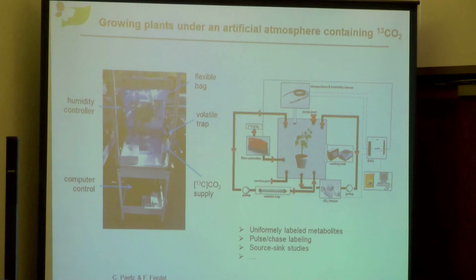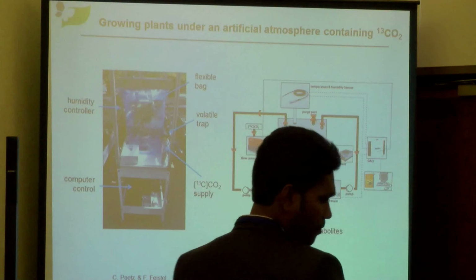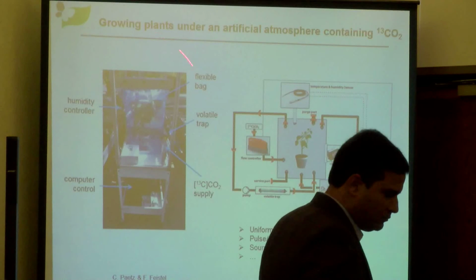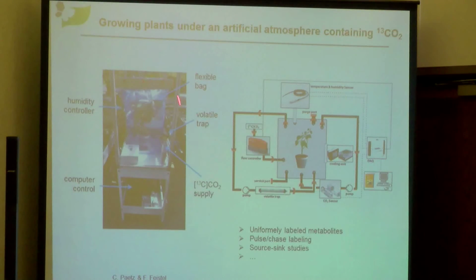There are some commercially available incubation chambers for this kind of experiment with labeled CO2. We have constructed our own one, which has a flexible bag size or container size, and which can fully control the conditions inside this chamber.